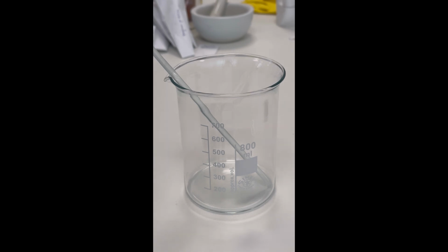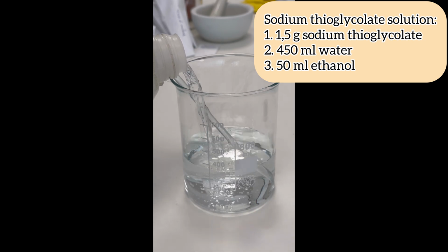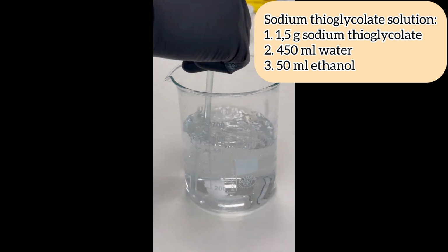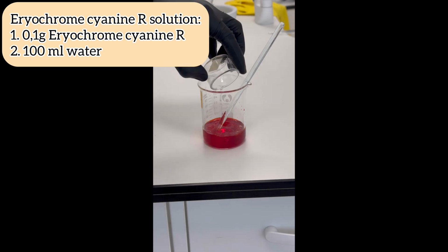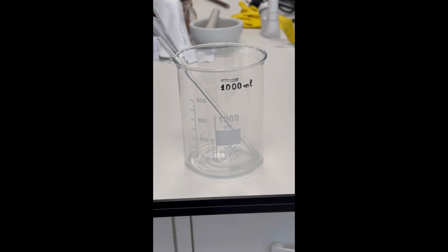We start by dissolving 1.5 grams of sodium thioglycolate into 450 milliliters of distilled water. After everything dissolves, 50 milliliters of absolute ethanol are added. Next, we weigh 0.1 gram of Eriochrome cyanine R indicator and dissolve it into 100 milliliters of distilled water.